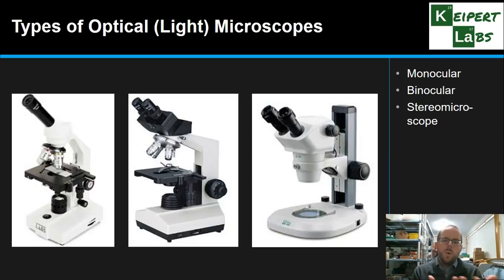That's one reason why if a person loses one eye, they often have difficulty, and they're not allowed to drive and things like that, because they can't perceive distance or depth the same way we can. So a stereo microscope allows you to view objects up close as though you were seeing them in real life, rather than just a flat image.